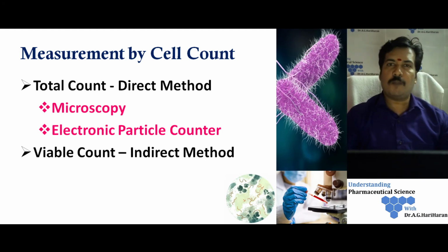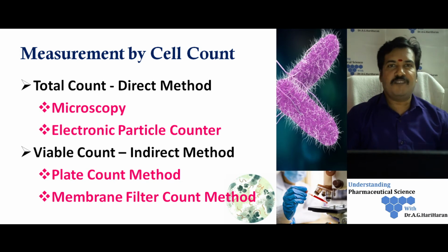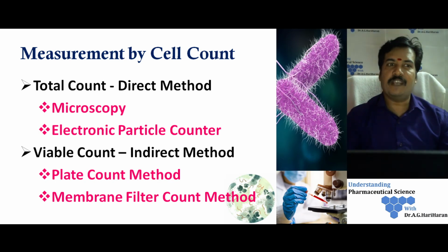There are two common methods available in this technique. One is the plate count method and second is the membrane filtration technique. I have given a separate lecture for each method that is involved in the cell counting technique. The microscopic method is also available in a free video lecture. You can watch it later. And the electronic particle counter is available separately. Similarly, the viable count also.